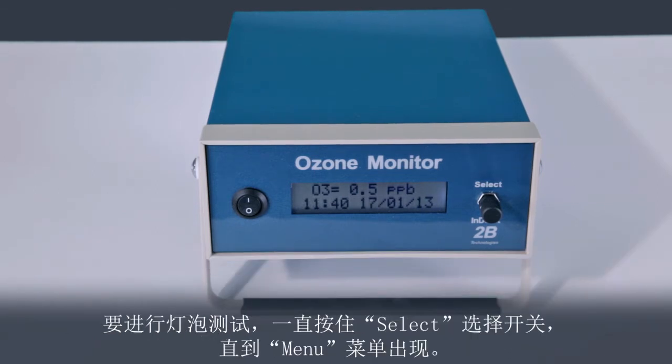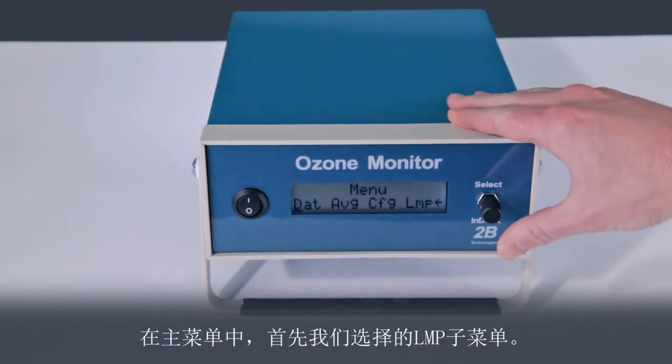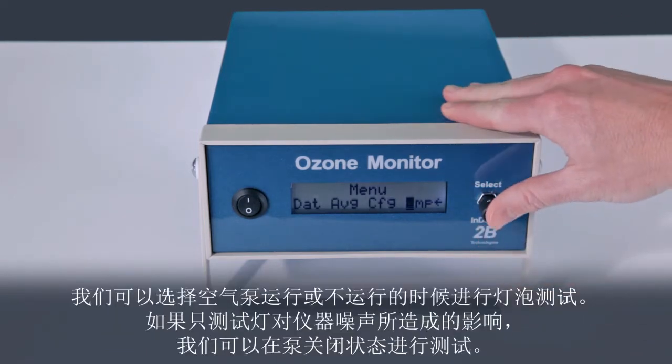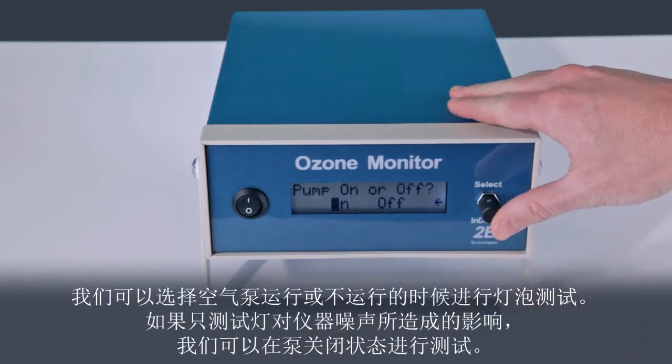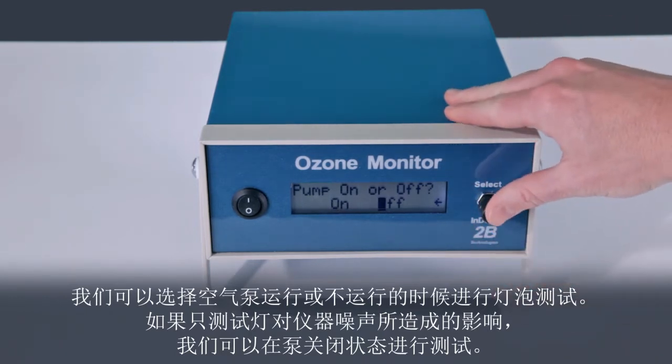To run the lamp test, hold in the select switch until the menu appears. In the main menu, we first select the lamp sub-menu. We can run the lamp test with or without the air pump running. To test only the effect of the lamp on the instrument noise, we will run the test with the pump off.